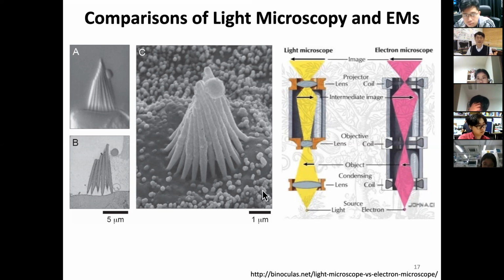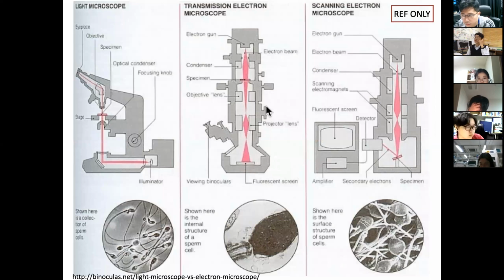Typically, this is a little complicated, so it's more expensive. So here comes the question, what about TEM versus SEM? All right. So with light microscope, now you guys are experts. Let's say we are watching sperm cells, let's say human sperm. You can have a live image of sperm moving around, swimming around, but you can't do that in electron microscope, but it has high resolution. Look at this sperm head. You cut it, and then TEM shows much more detail inside the structure of the sperm head. How? By using transmission EM. How to prepare that?